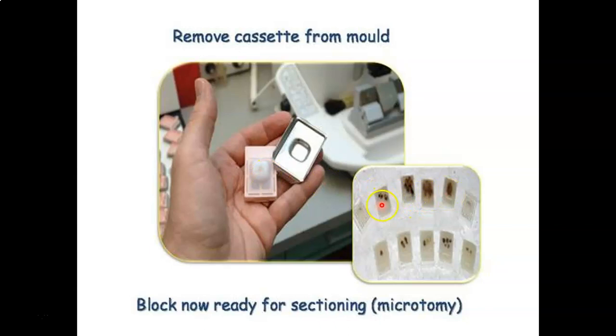As you will see, this is the block, another block. Notice the tissue within the block. This is a third block, fourth block, and so on. You will find the tissue in a brown color within the wax in the white color.